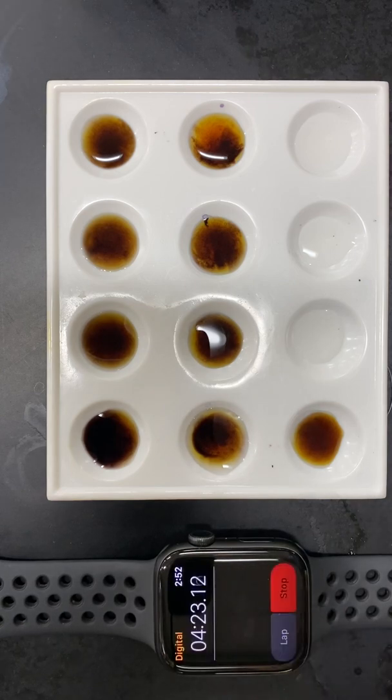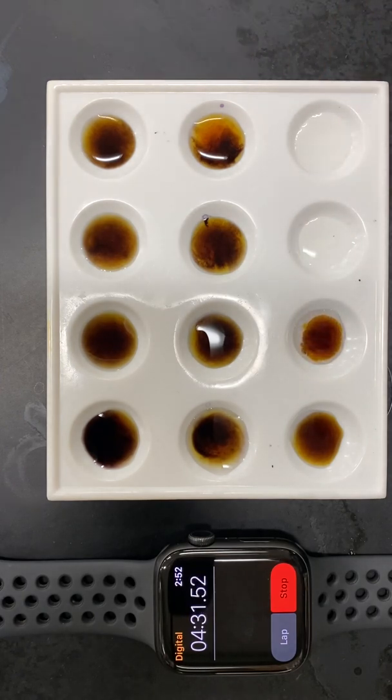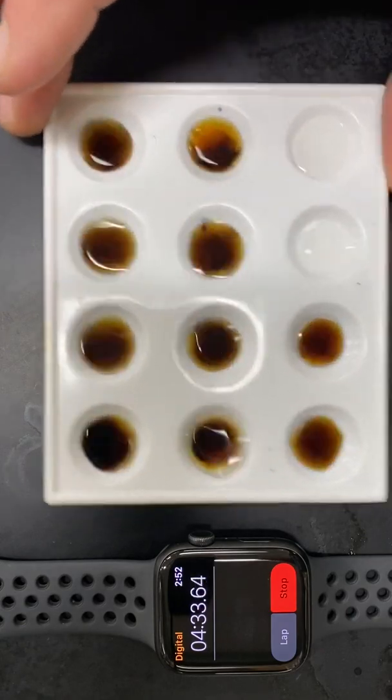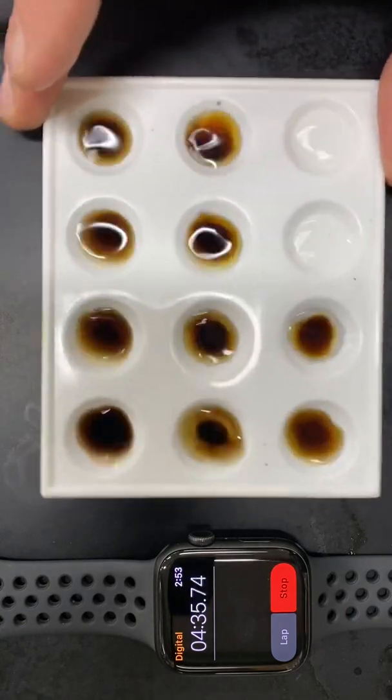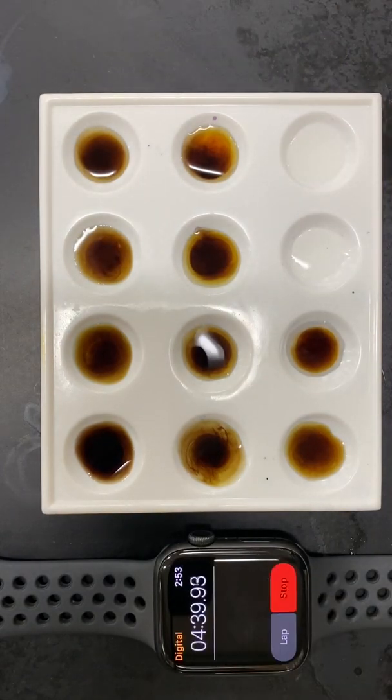More to go. I'm just swirling it to make sure that it gets reacted.